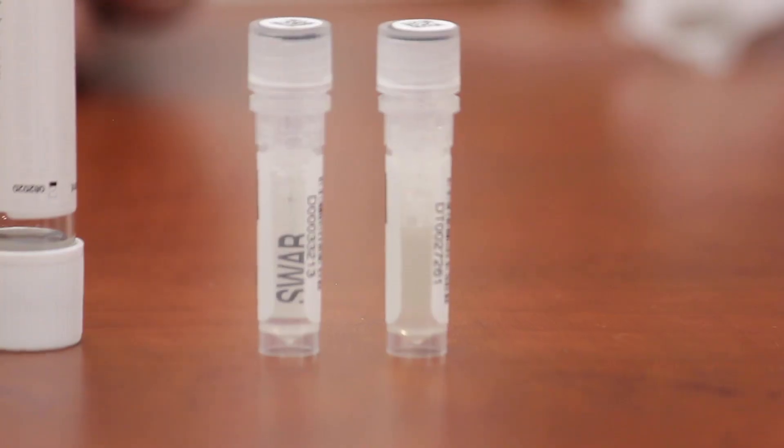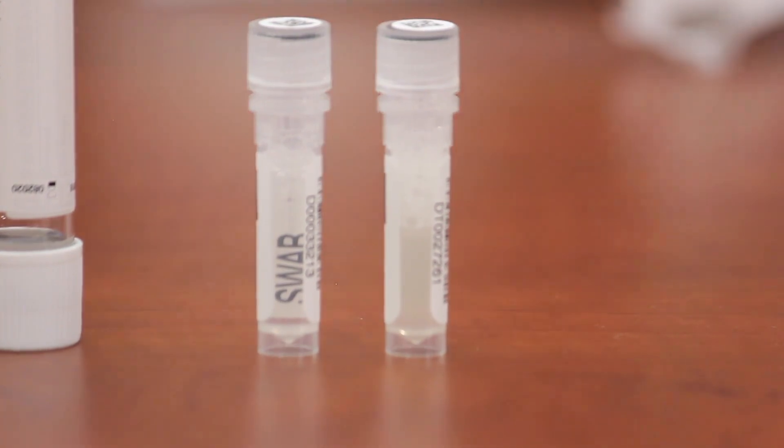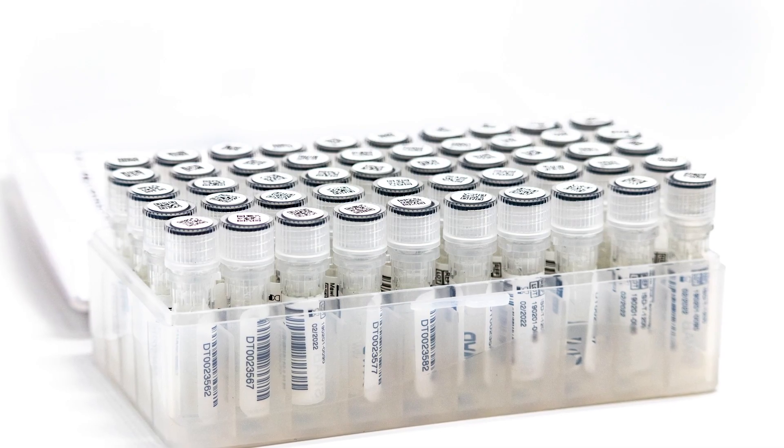In the past, each swab would have to be processed individually by a lab, but with iSwap you can collect and consolidate the material from up to one to four swabs into a single device in a predetermined volume, which stabilizes and preserves the sample for extended periods of time at room temperature.